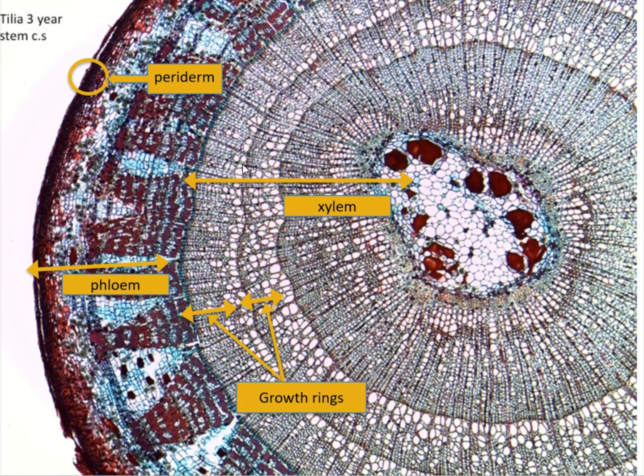So if you look closely, you see that the thickness of the rings, as you can see from my mouse cursor, some are thicker than others. And this thickness actually tells you how much water was absorbed by a plant in a given year and how much the plant grew. So for instance, in between these rings, you see how the regions are a little bit thicker, right? So while the number of rings tell you the years of the age of the plant, the thickness tells you how much water absorbed.